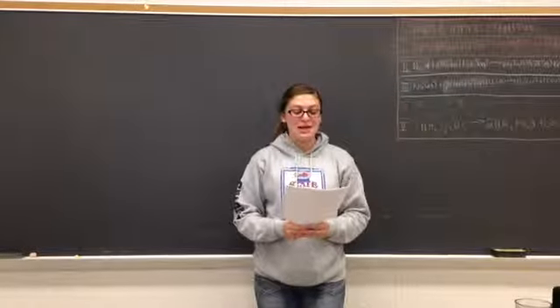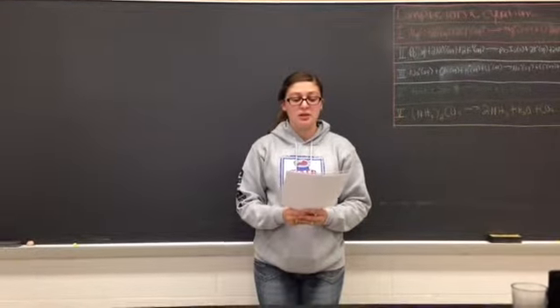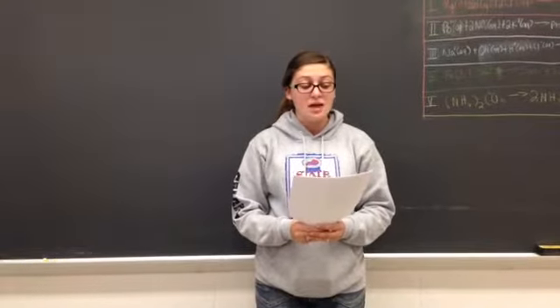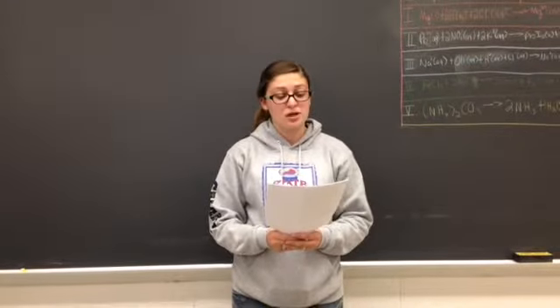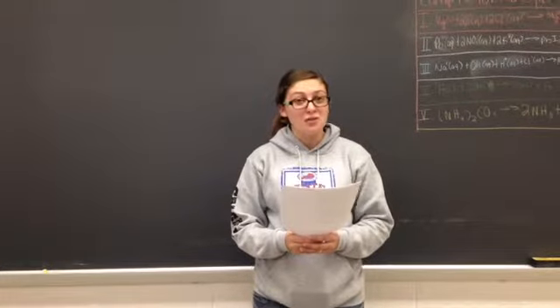Part 4, we will be reacting FeCl3 solution with NaOH. Transfer 1 milliliter of 0.1 molarity FeCl3 solution into the test tube. This will be a cloudy orange solution. Transfer 1 milliliter of 0.1 molarity NaOH. This will be a clear and colorless solution.